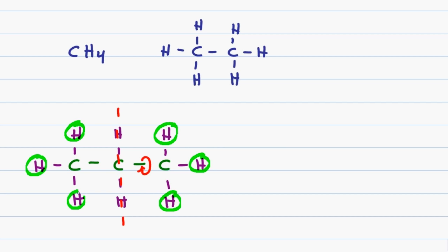This gives me 1 type of hydrogen. And then I have 2 hydrogens on the central carbon. However, these are different from the terminal hydrogen based on the fact that they are located on a secondary carbon, while the terminal hydrogens are located on a primary carbon.